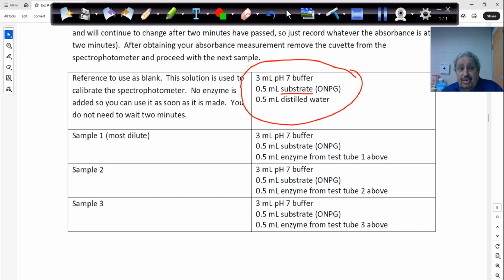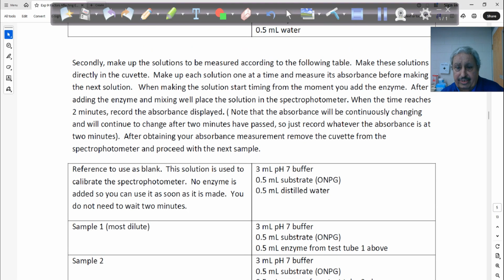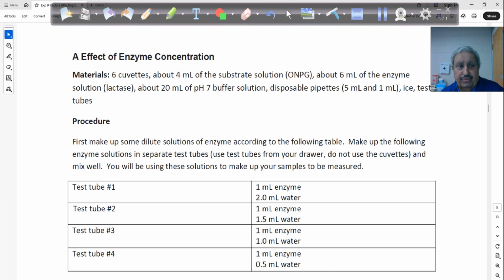So that's your reference. Before you start any measurements, you have to enter your blank. The blank is telling the equipment, the spec 20, that my data is related to this reference. This is my reference here, or blank, correct? And it says what wavelength you have to put. I think the wavelength is given as 420 nanometers. You'll find it somewhere here at the beginning of the whole thing.